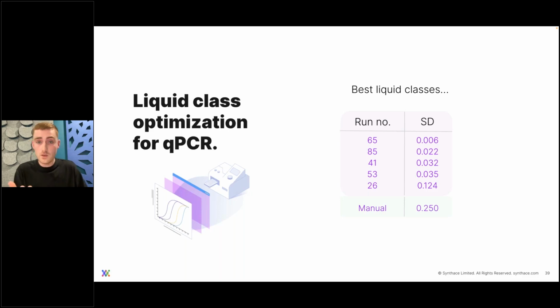Because he used DOE, not only would he know the liquid classes that performed best, but he could also find the most statistically significant factors, effectively those liquid class parameters that are worth fine-tuning. Things like mixing and aspiration speed, I believe in this example, were crucial factors. And this is really neat because it allows him to iterate. If he had more time, I'm sure he'd fix the levels of factors that weren't statistically significant and then fine-tune the ones that were.